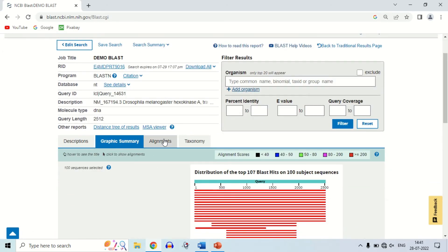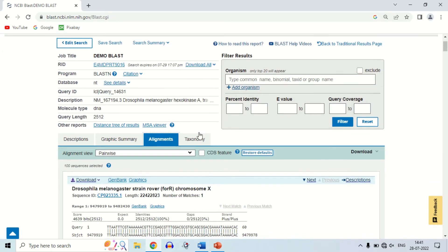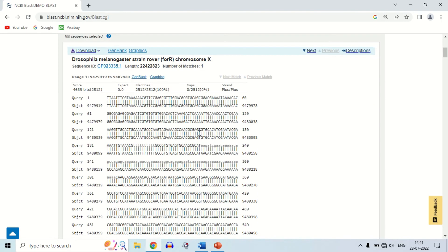Next is alignment. As you click on alignment, you will see the sequences to which your query has been aligned. As per the FASTA format rule, it takes only 60 letters per line. So it compares the first 60 letters, then 61 to 120, then 121 to 180, and so on — matching in lots of 60 letters. The organism shown is Drosophila melanogaster strain rover chromosome X. The first 60 nucleotides of your query sequence have matched completely with the subject.